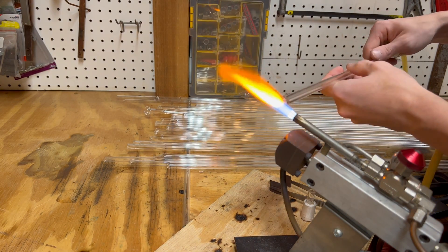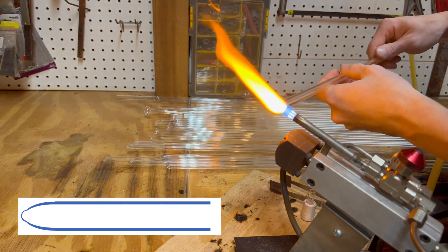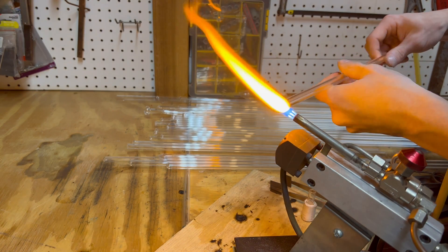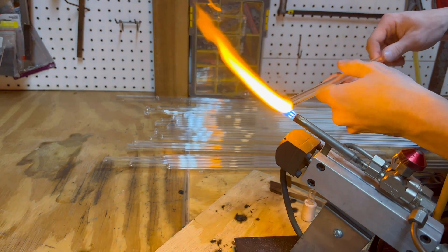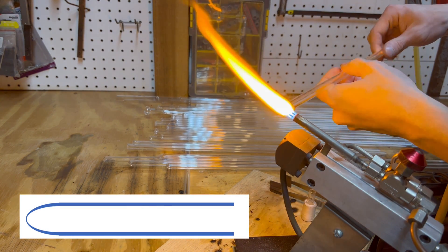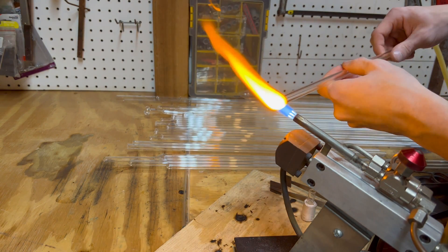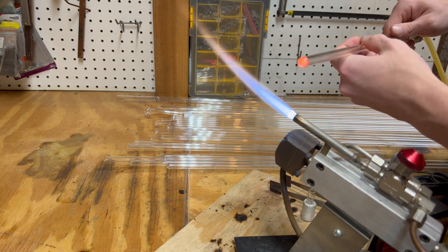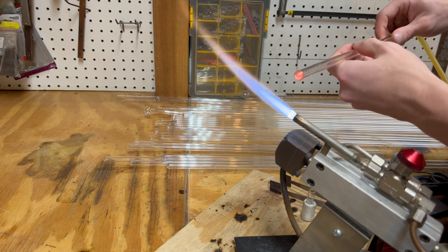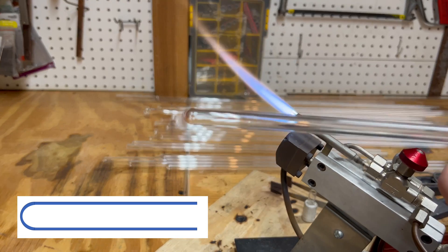Repeat this process until the full dome for the bottom of the test tube is formed. The goal is to have an even thickness all around. If this is not achieved, simply remelt and try again. Remember, keep spinning. Now that the bottom dome is made, let it cool, and once cooled, the next step can begin.